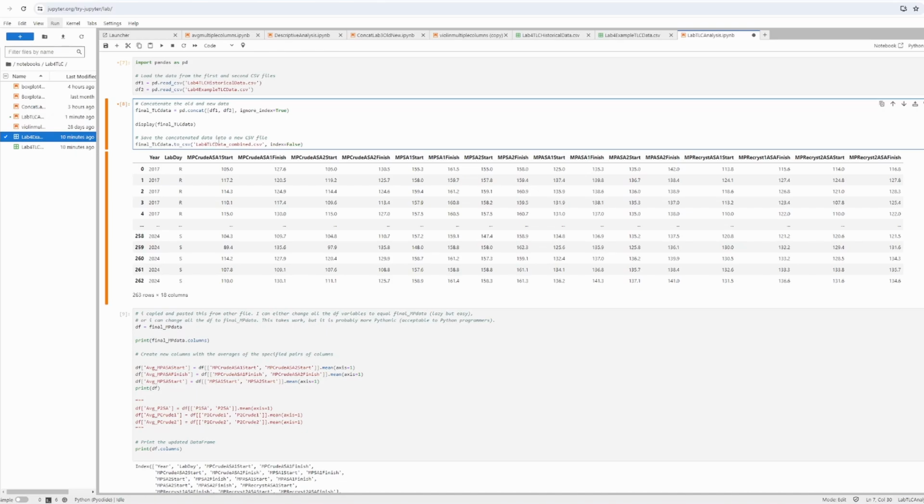TLC data combined. And so if we run these two cells, we should hopefully call in the two data frames for lab 4. So these two right here, we should be able to concat them. We'll put the bottom one here, so the TLC lab 4 example data will go underneath the main one, which is the historical. Once that's done, we're going to display it and see what it looks like, and we even save a CSV file, because then we can either modify the CSV file later when we're ready for it, or we can continue modifying here in the cell afterwards.